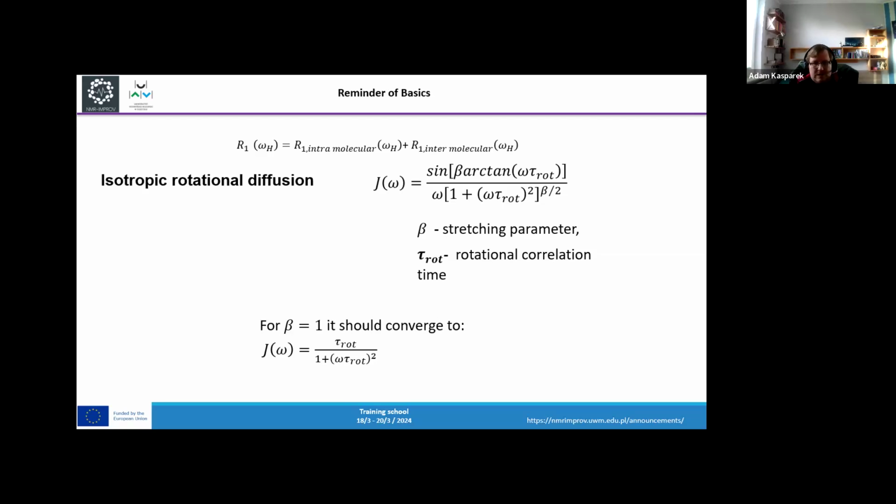I am showing it here because when we check this against relaxation rates, usually we have not only translation diffusion in our data sets, but some other types of motions. Very often in these data sets we have this addition, the rotations.